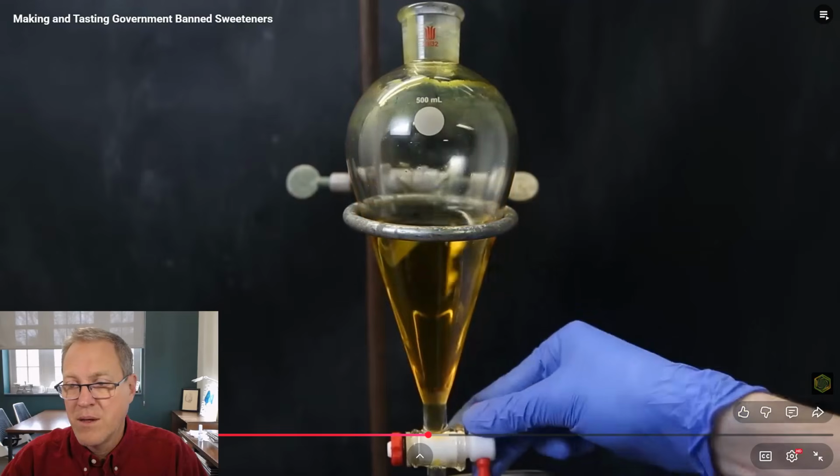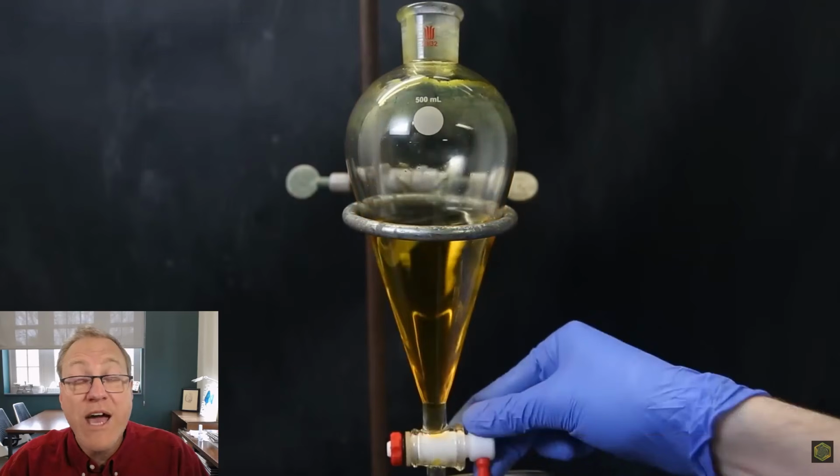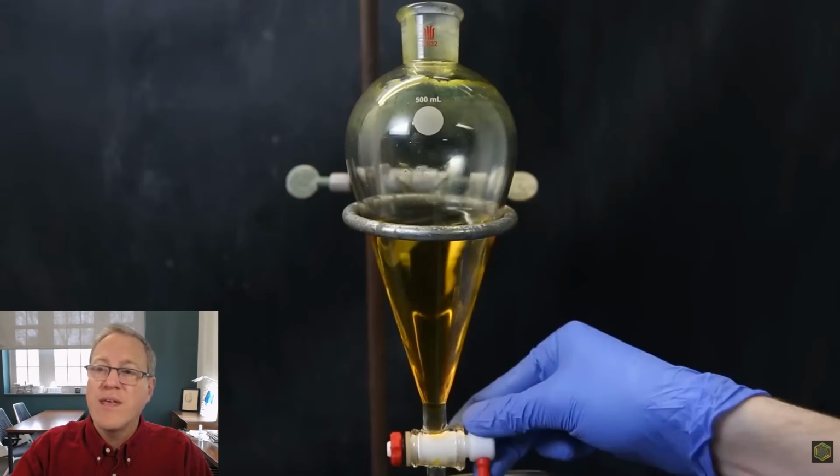I extracted it 2 more times. Oh, okay. Did you catch that? So he wants to collect that ether layer now which is separated from the water layer, but that water layer that he drained down still contains orange stuff. So he doesn't show this.